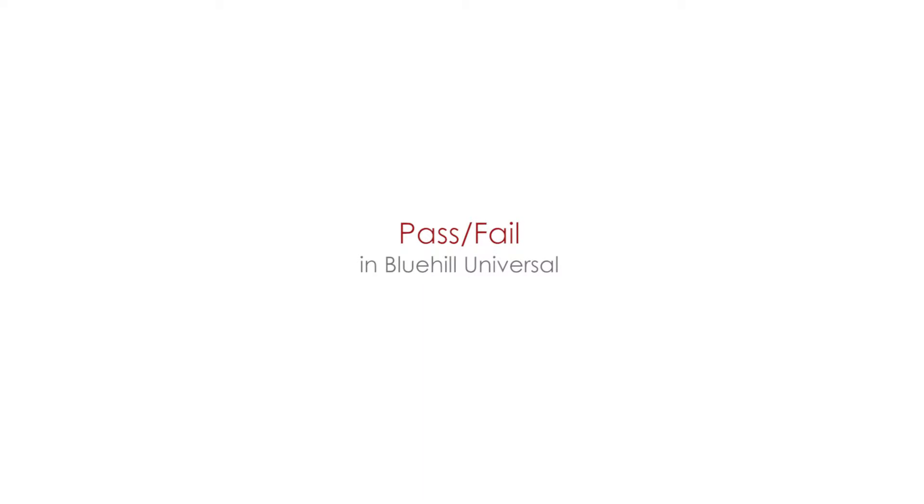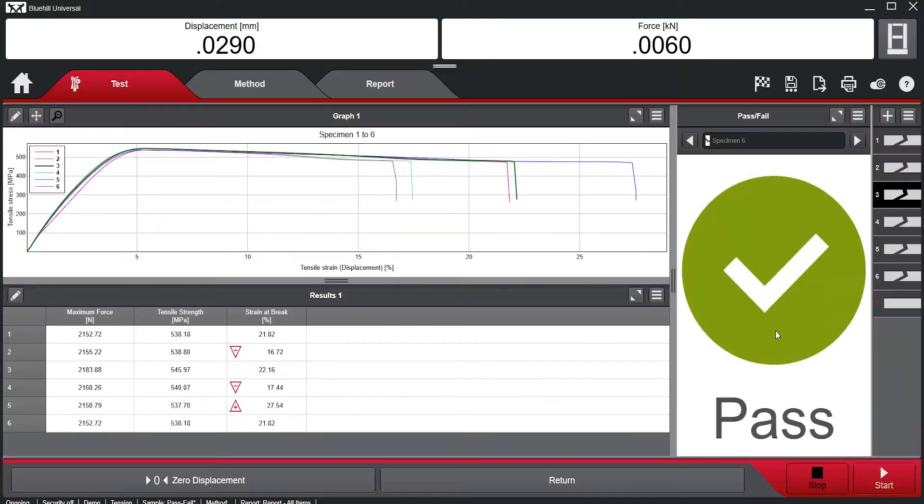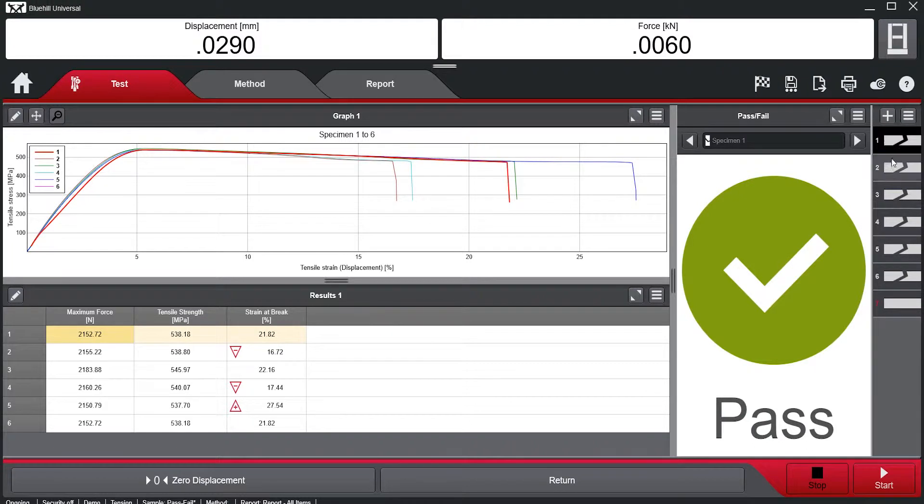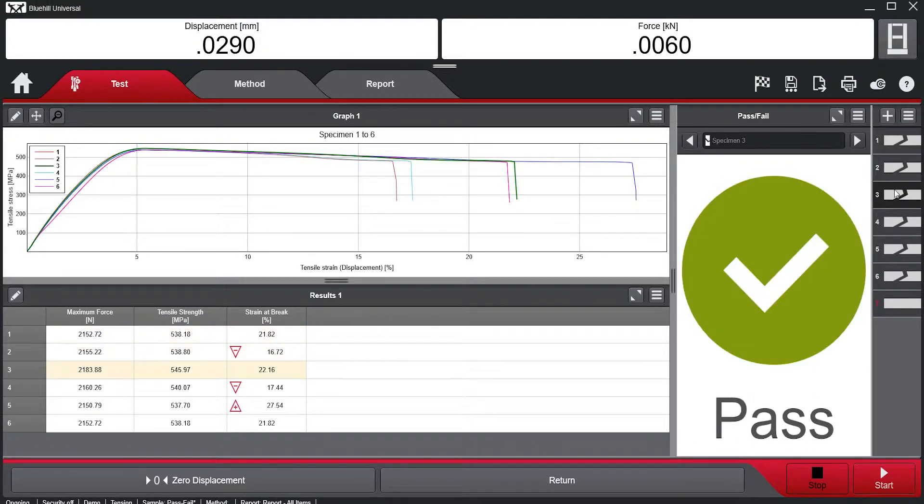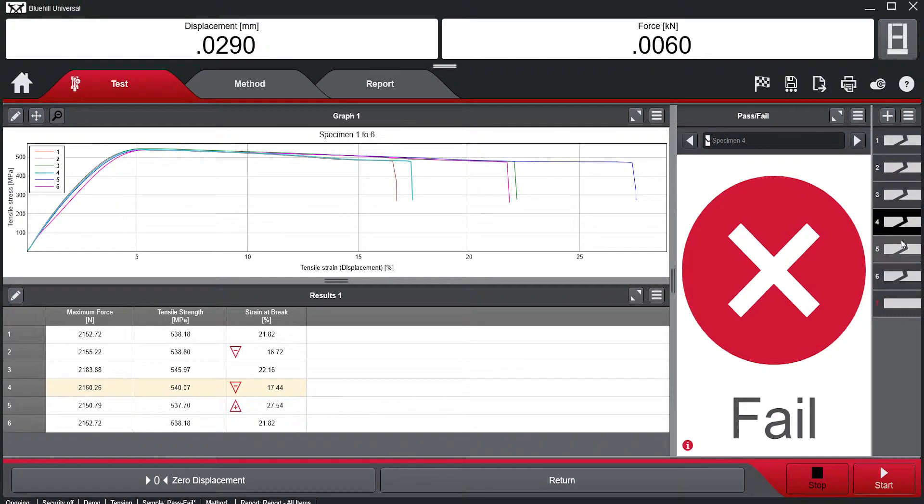The Pass-Fail module in Blue Hill Universal allows users to add a test component to the workspace to quickly visualize if a test passed or failed based on the acceptance criteria set in the test method.